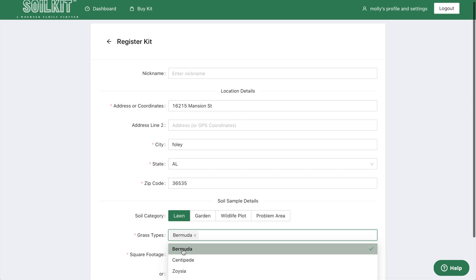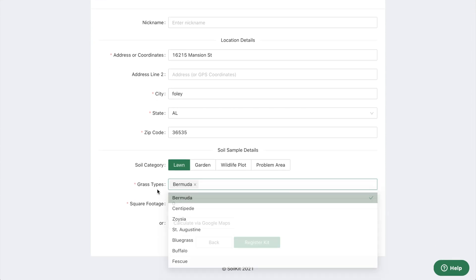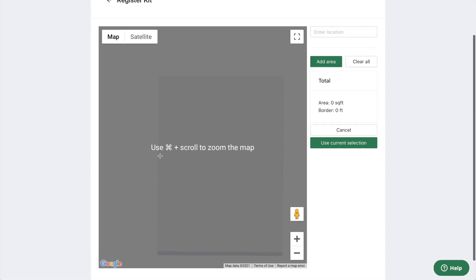Next, enter the size in square feet of the area your soil sample represents so we can accurately calculate fertilizer application rates. If you aren't sure, use our satellite guided sizing tool.